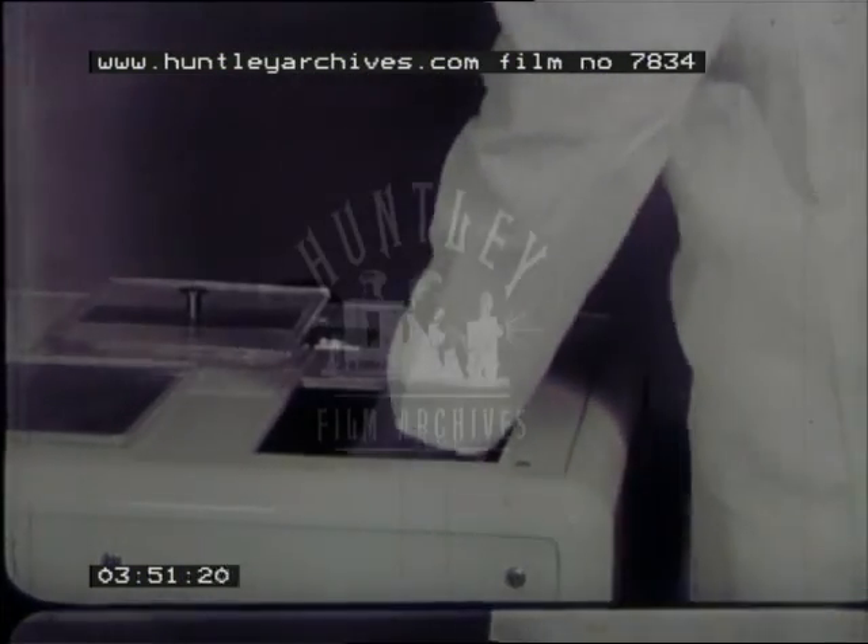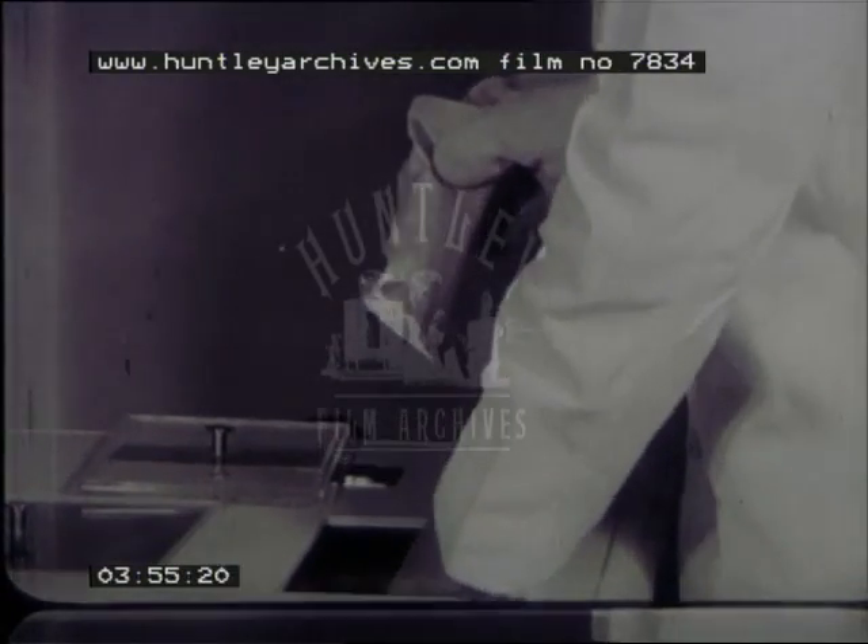When the temperature of minus 70 degrees centigrade is reached, the specimen is transferred to the bank, where it is stored at minus 197 degrees centigrade in liquid nitrogen.